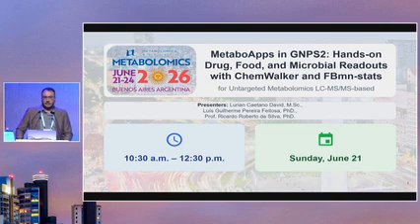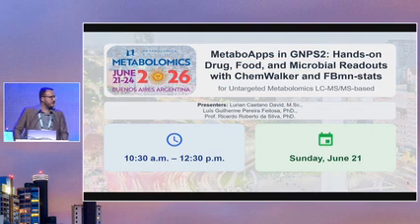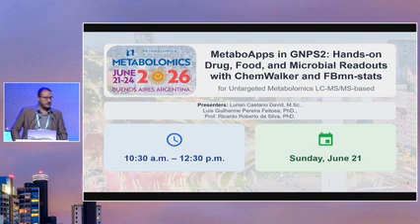My name is Lurian. I'm a PhD student from Brazil. But the idea for this workshop actually started as a PhD visiting program that I was doing in Pieter Dorrestein's lab at UC San Diego, which is one of the labs that started and is the foundation for most of those tools, as the GNPS is the platform where all the tools that we are going to present now are hosted.